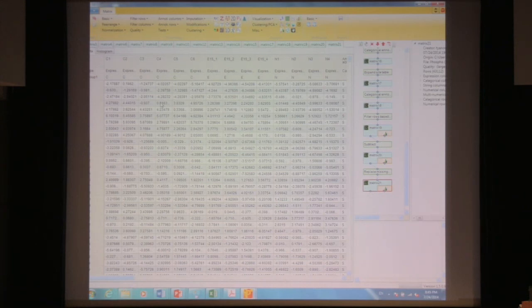It means that both the heavy and the light are low, so you can assume that it's low, and then we impute. The values might be different. Usually the downshift that I use with a SILAC standard is lower than the value that I use for label-free, but we still do it, and the assumption should still be correct. Of course, if you're using classical SILAC, it's irrelevant.